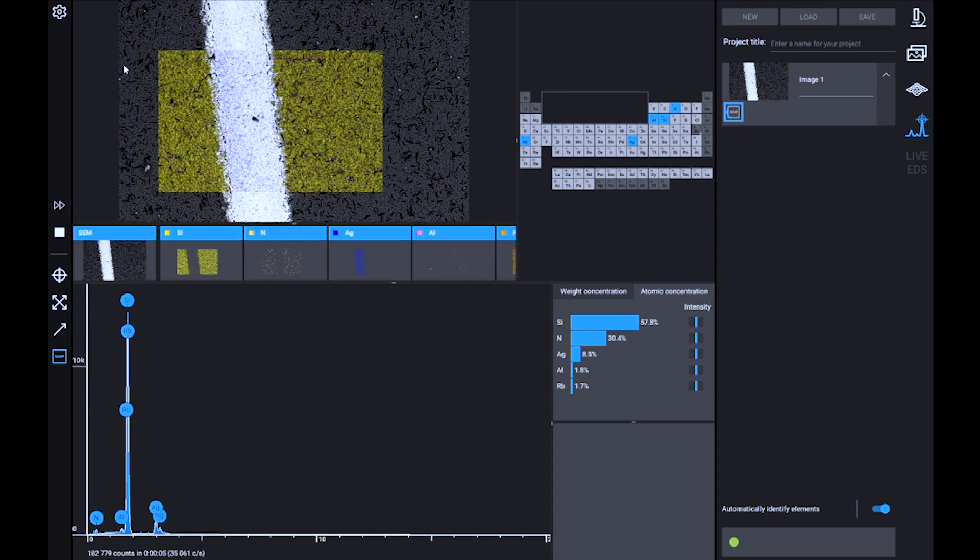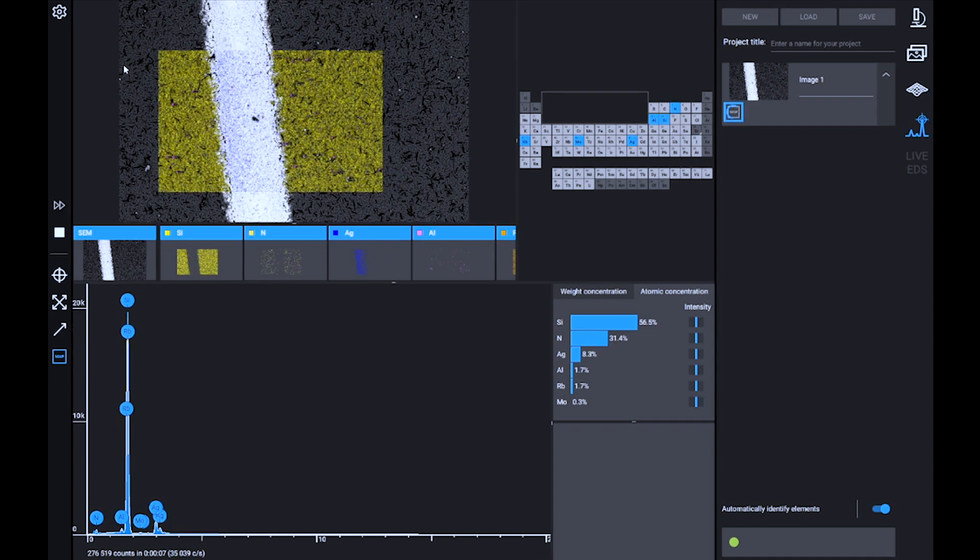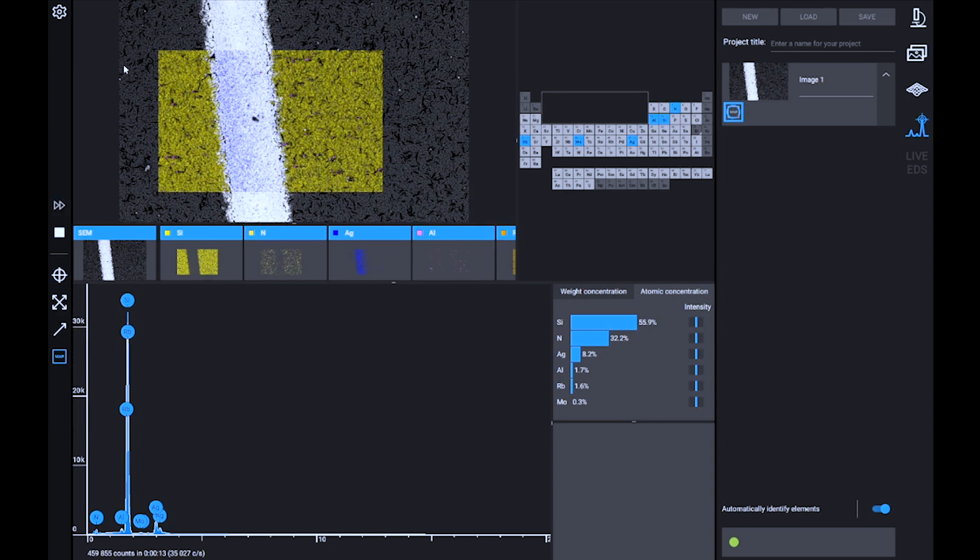In this case, for example, we can see a distribution of silicon in yellow, aluminum particles, and in blue, the silver that's creating a stripe on this solar cell.